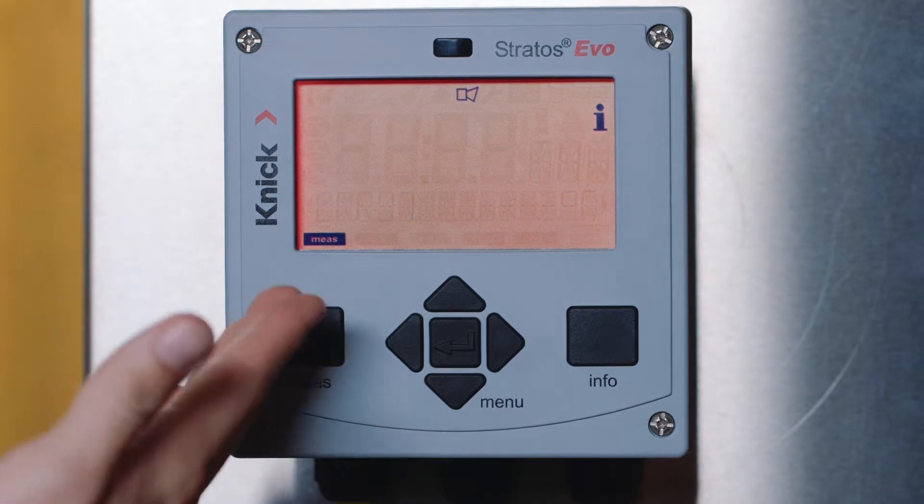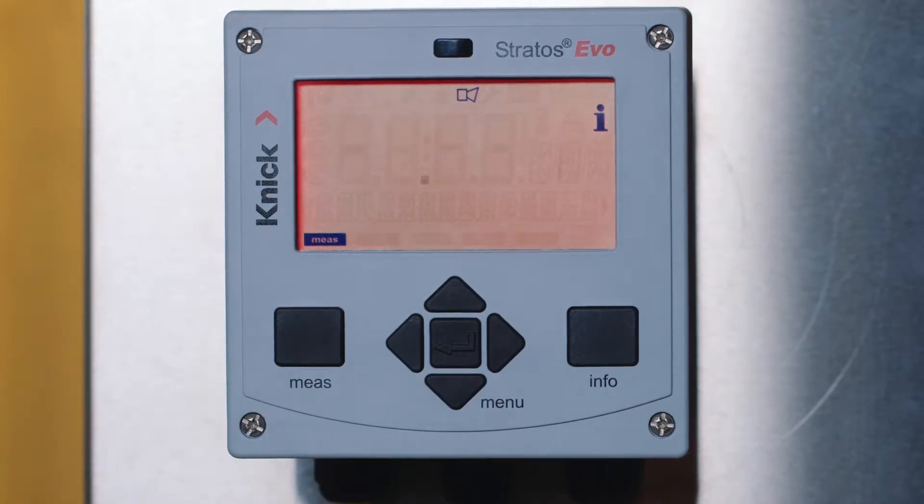You'll notice that we currently have an error and the screen is red. This is because we have not yet configured the transmitter for a MemoSense sensor.